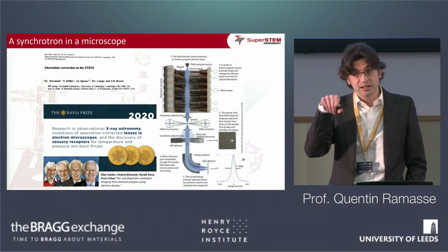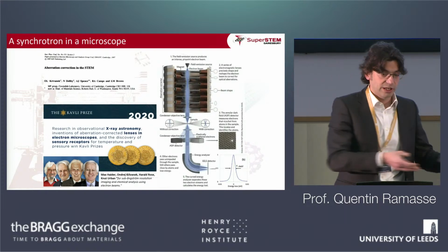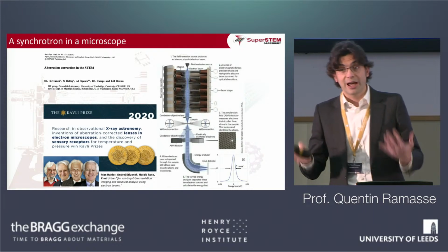And as with all scanning probe microscopies or scanning microscopies, the power of that particular technique is really that you go and interrogate one specific position at the sample, one atomic column, one atom, one small location, and then collect as much data as you can out of it.